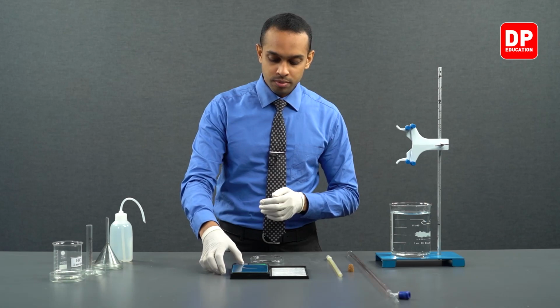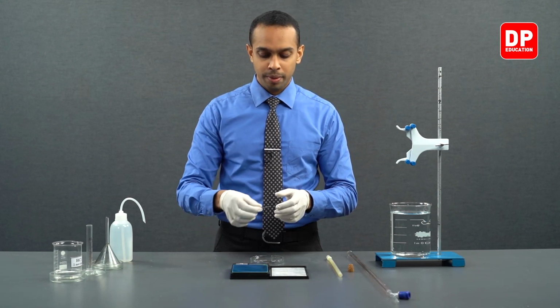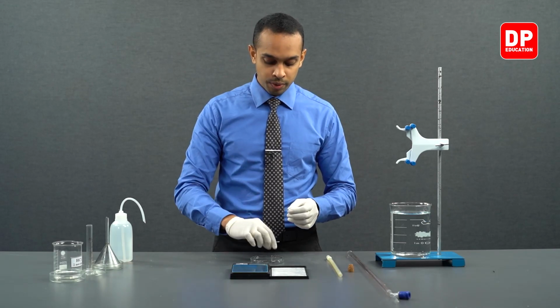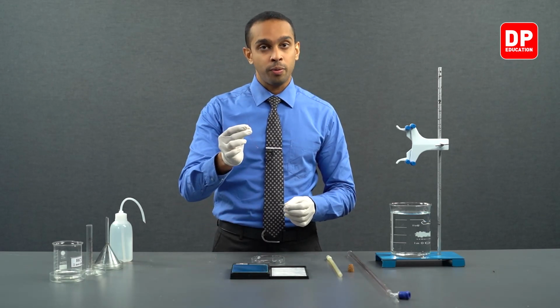Now, let's take this magnesium strip and tie it with our copper wire.